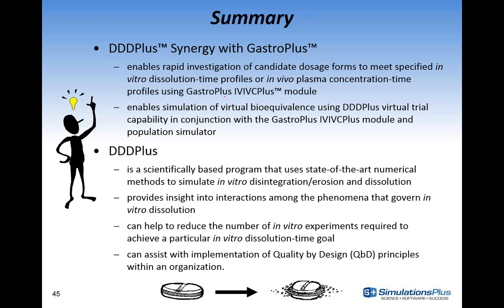In conclusion, DDDPlus is a scientifically based program that uses state-of-the-art numerical methods to simulate in vitro disintegration, erosion, dissolution, effect of surfactants, et cetera, provides insight into interactions amongst the phenomena that govern in vitro dissolution. I hope we've shown that it can help reduce the number of in vitro experiments required to achieve a particular in vitro dissolution time goal and to meet some target PK endpoint.